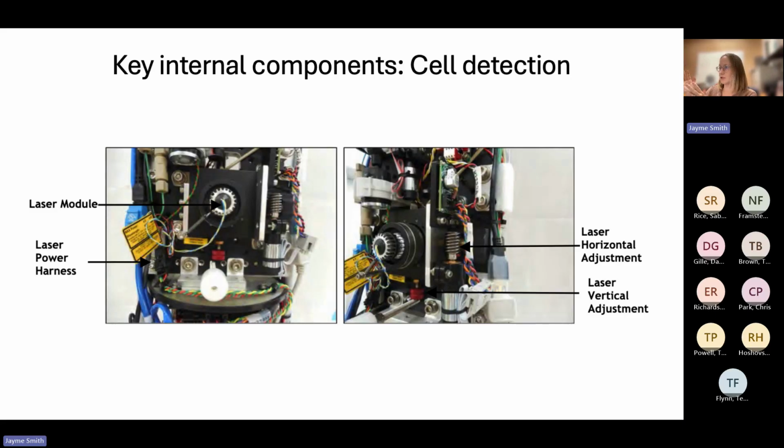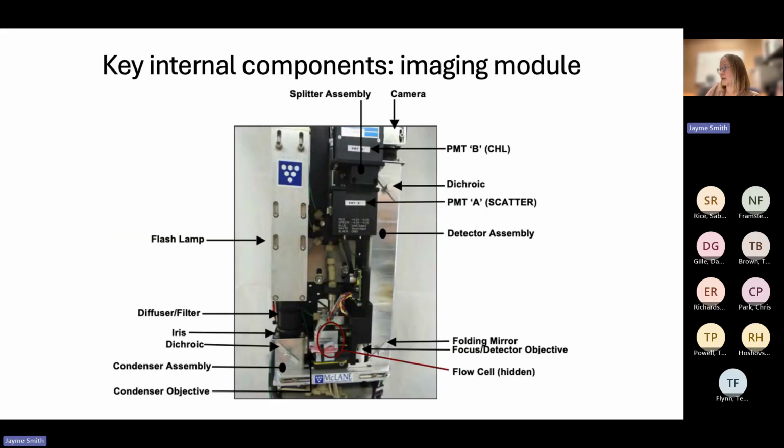The reason you'd want to adjust it from a distance is that a lot of these are deployed on piers. Say it gets hit by a wave or something, it can put the instrument out of alignment. So you can try to realign it from back at your desk without going into the field. That doesn't always work, but at least you can try, and then if you didn't get it, you have to go out, pull the instrument, take it out of its housing and readjust it. But it does have some stop gaps that sometimes save you, depending on how active the environment is.